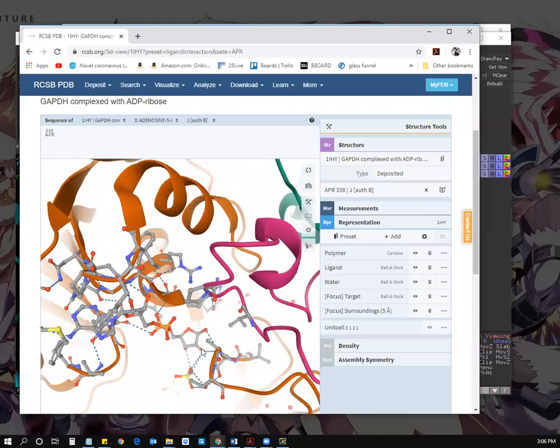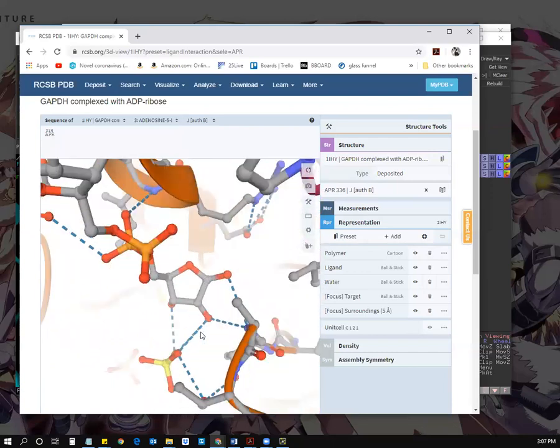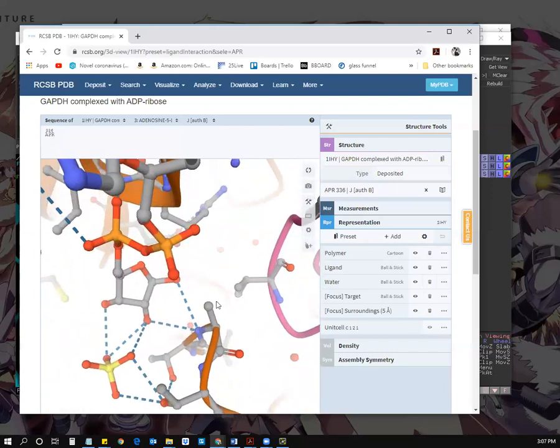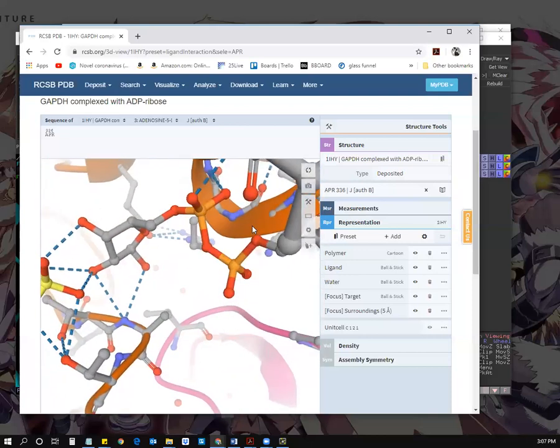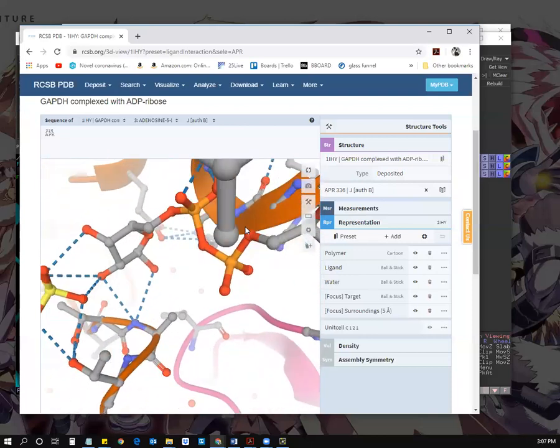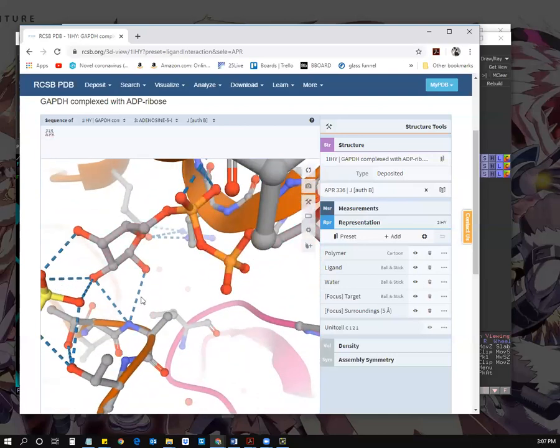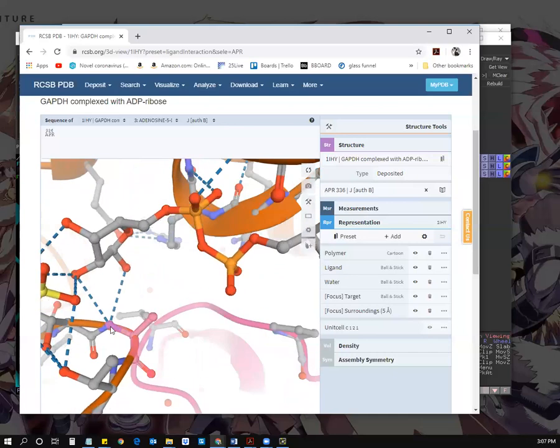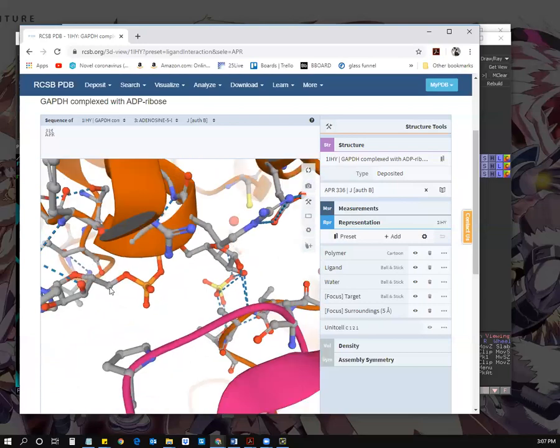Oh, okay, so over here, I'm spotting the ribose furthest away from the adenine molecule. It looks like it's not only interacting with the phosphate ion that we really don't care about, but it's got some other interactions there as well. But this doesn't really look promising, because these two oxygens seem to be interacting with the amide group in the peptide bond here. So this is not something that I want to focus my attention on.